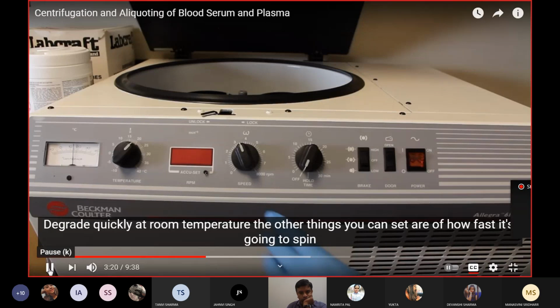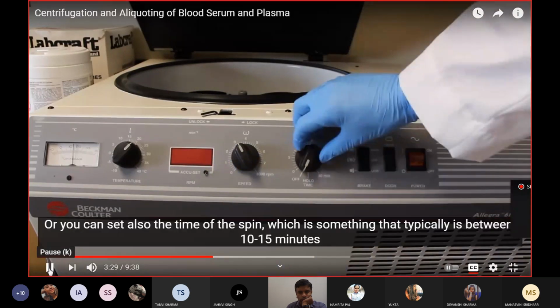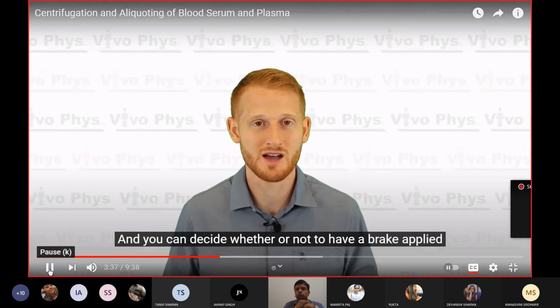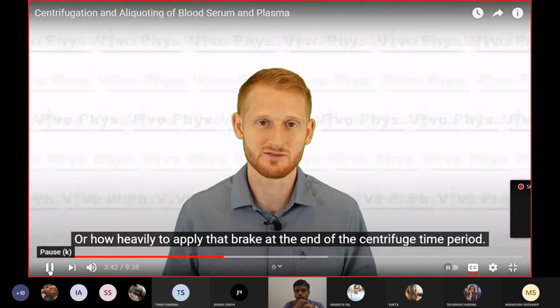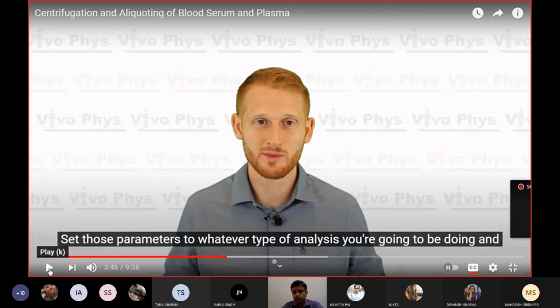The other things you can set are how fast it's going to spin. I'm going to spin it just beyond 3000 RPMs. Or you can set the time of the spin, which is typically between 10 and 15 minutes. And you can decide whether or not to have a brake applied, or how heavily to apply that brake at the end of the centrifuge time period. Set those parameters. He also talked about the brake. Usually we don't apply a brake.